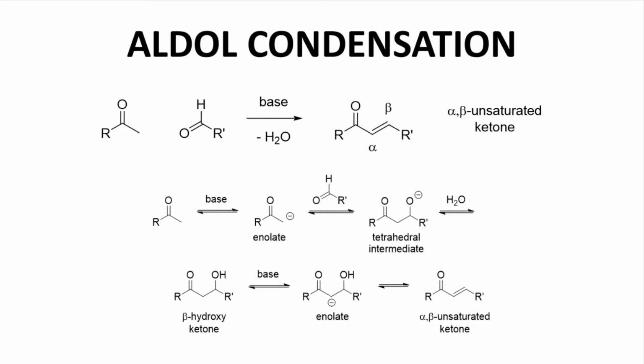Very often the final product is relatively insoluble in the reaction. In order to achieve equilibrium, the reaction generates more and more product, only to have the product concentration never increase, because the product continuously precipitates from the reaction solvent. Okay, so these are some of the essential ideas of aldol chemistry.